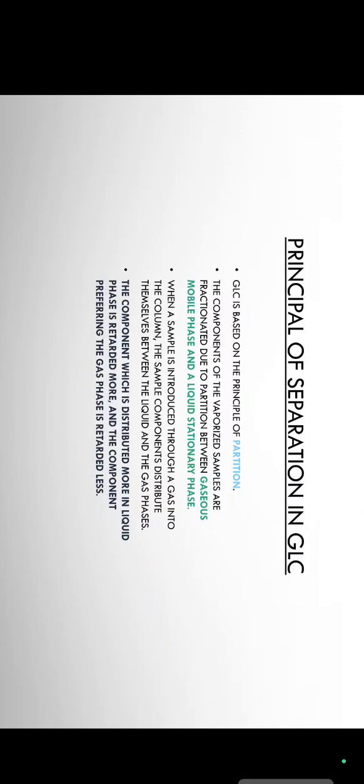And this is the principle of separation in gas liquid chromatography. Earlier I said that GLC is the successor of column chromatography. So here also the same principle is applied, that is the partition principle. So GLC is based on the principle of partition. The components of the vaporized samples are fractionated due to partition between a gaseous mobile phase and a liquid stationary phase.